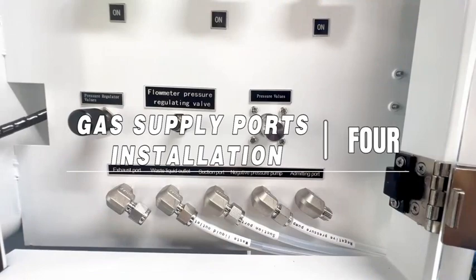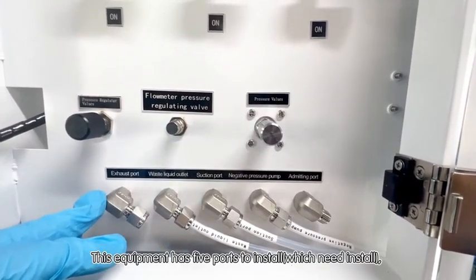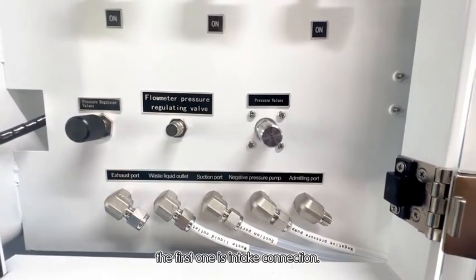Gas supply ports installation, step four. This equipment has five parts to install. The first one is the intake connection.